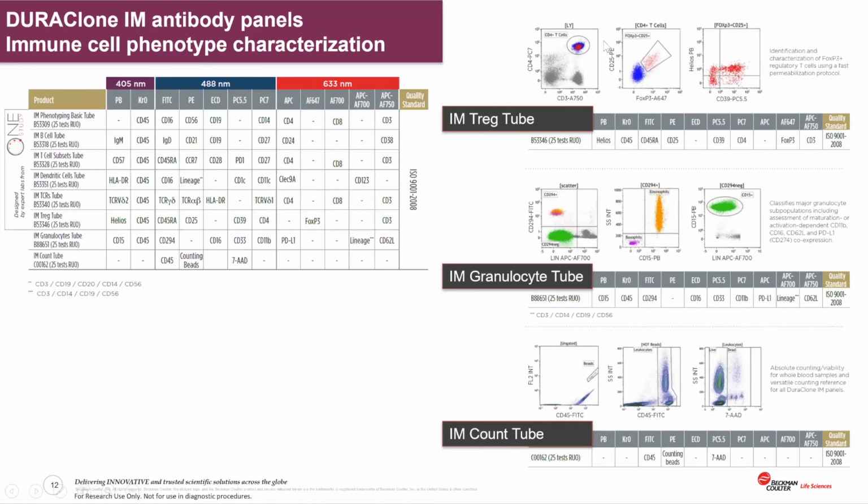So specifically when looking at the Treg tube, it characterizes the Tregs based on CD25, FOXP3, as well as CD39 and Helios. What's important to note is that this panel can be utilized as a base with additional drop-ins. So let's say that in addition to just assessing my T cells based on my Tregs, based on FOXP3 and Helios, I wanted to actually look at the memory phenotype of my cells. I can additionally add CD127 and CCR7 and look at the actual proportion of memory cells.